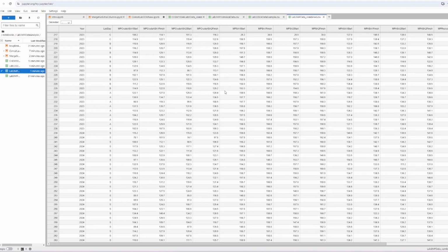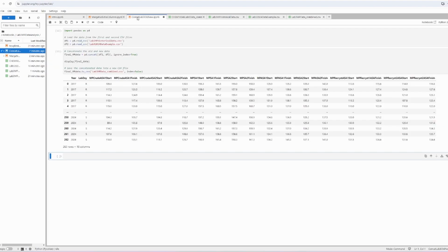Okay. And what that does is make it easier for us to go through and use group by to figure out what's going on. We can do stats analysis by calling in one data frame, say this one here, and then calling in a second data frame and working on that as well, trying to compare statistical analysis or a t-test or whatever by doing two different files.